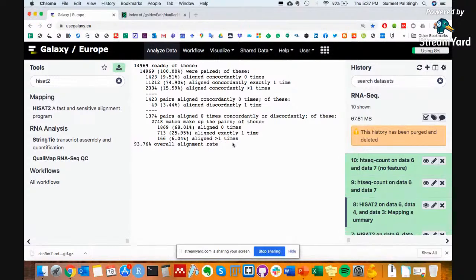And because you have to amplify your cDNA a lot, even mutations get included, mutations are introduced. So then the alignment rate decreases. But this is a number to keep in your record when you're comparing different ones. Anything above 60% is really good.